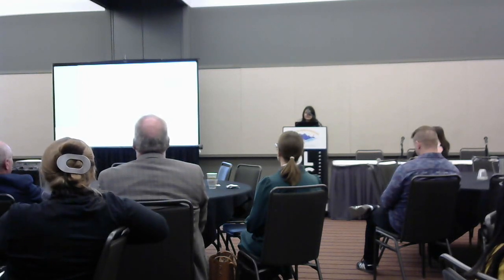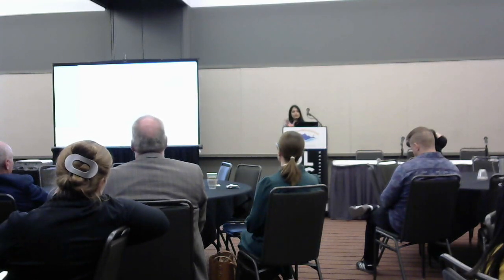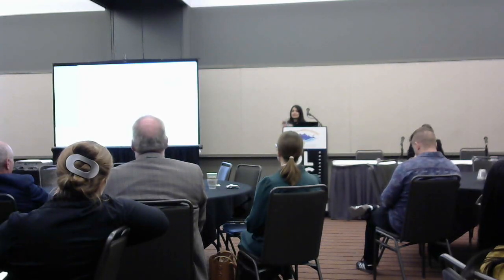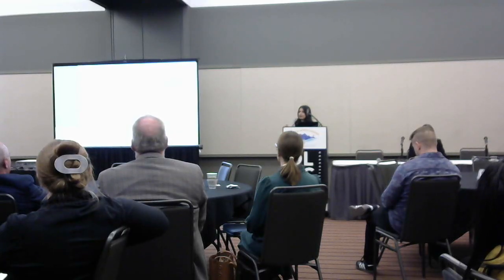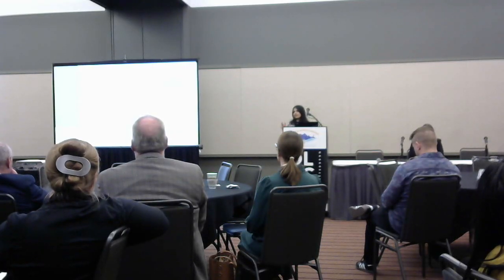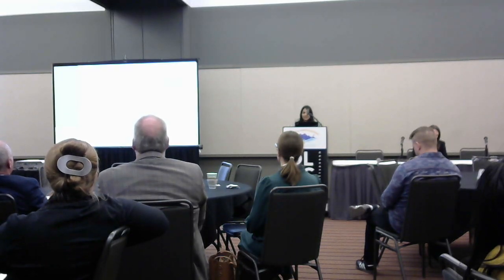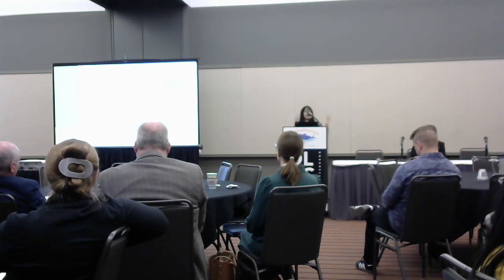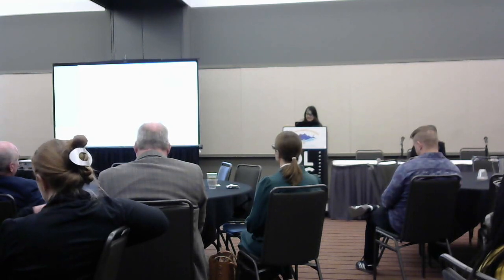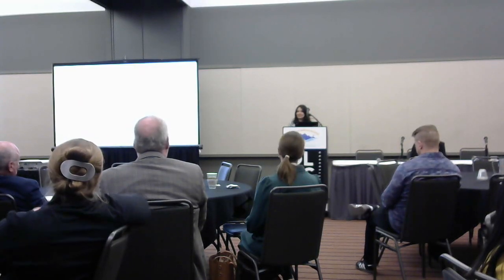And the Zeiss Arivis Hub, I've heard from users that the Arivis software can actually handle terabyte-size files really well. And one thing I like about Arivis is it's format agnostic. So you don't need to have data which was acquired on a Zeiss instrument specifically. It can be any other format also. And this can be run either locally on a server or on the cloud as well. So just something to think about if you're thinking about scaling your analysis pipelines. And with that, I come to the end of my talk, and I think we can open the room for questions. Thank you.